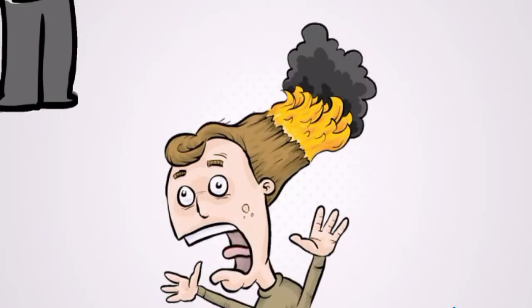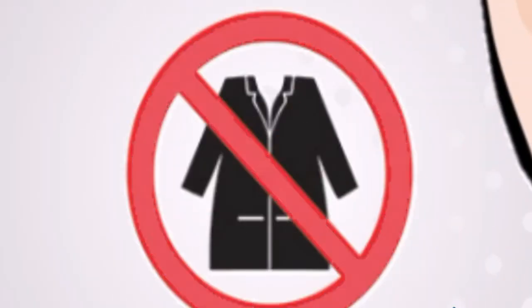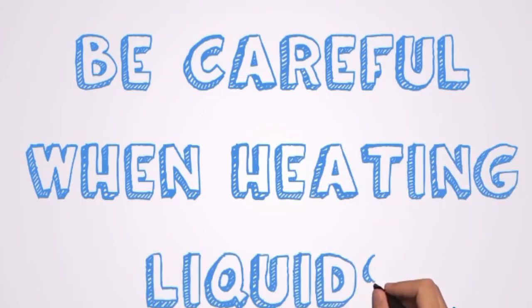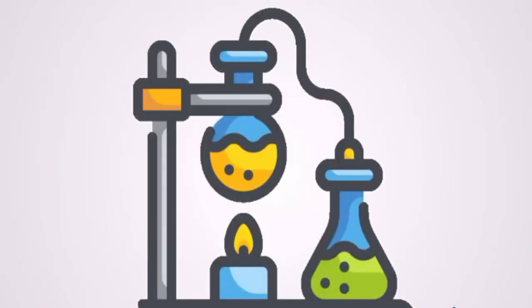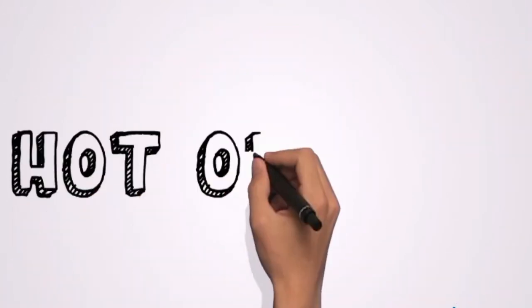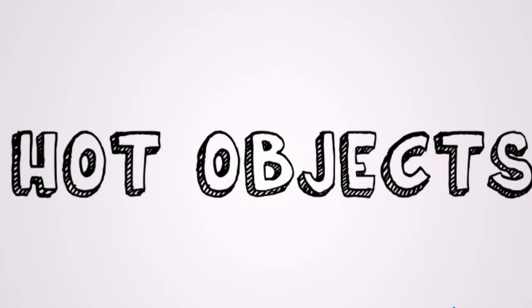Rule 5: Confine long hair and loose clothing in the laboratory. It may either catch fire or be chemically contaminated. Rule 6: Be careful when heating liquids. Add boiling chips to avoid bumping. Rule 7: Never put hot objects on the bench directly, but place on an asbestos board to cool.